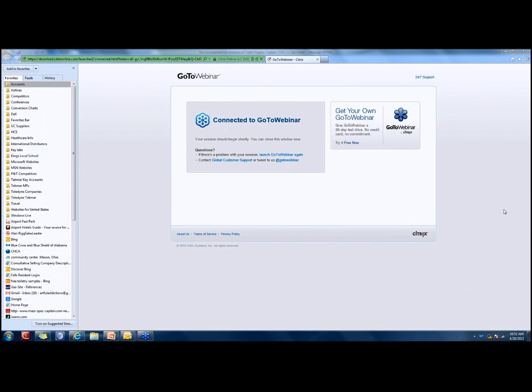All right. It was mentioned that the TOC system can handle samples with particulates. Is there a limit to the amount of particulates the system can handle before the samples are diluted before analysis? So, very good question. Again, most systems, due to the tubing that is in the sample pathway, the particulates must be less than 0.8 millimeters. Now, if you have a lot of sediment, you may want to filter your samples before that.